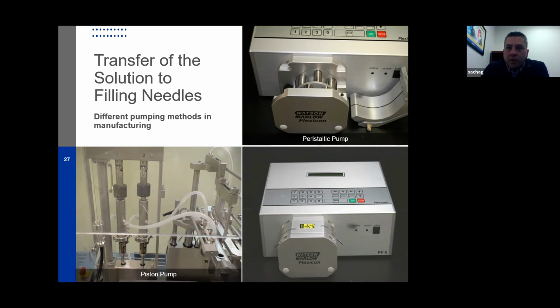The big challenge with those is it's important to perform studies to determine how long you can use your silicone tubing in that pump before you start to see degradation of the tubing. What we've seen is that for specific types of tubing, since they're being compressed over time, often they could split at the sides, or what's also very common is that the inside of the tubing rubs together and it creates spalling. So you'll end up with small pieces of silicone tubing in your filled vials. Those are studies that are important to conduct before you just use tubing for an extended amount of time.